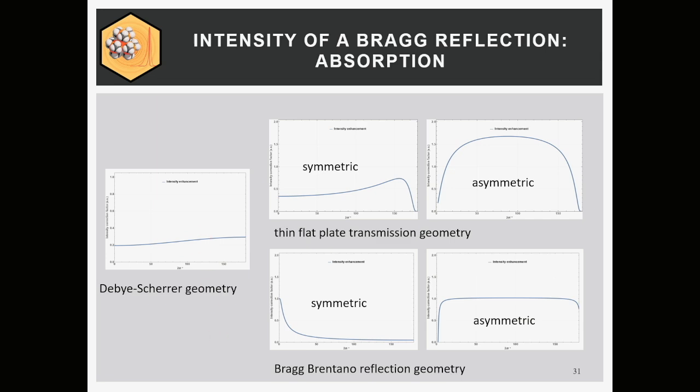You can easily imagine what it means in a Debye-Scherrer capillary. If you have, let's say, a strongly absorbing material in the capillary, the beam comes in at very low angle and has to penetrate the entire capillary, so there's a lot of absorption. If you go to higher angles, even backscattering, then the outer parts of the powder scatter back, so there's much less absorption. So the absorption actually decreases with increasing angle. If you don't take this into account, and you don't have the chance to use high energy, then you have a problem in quantitative phase analysis or structure determination.